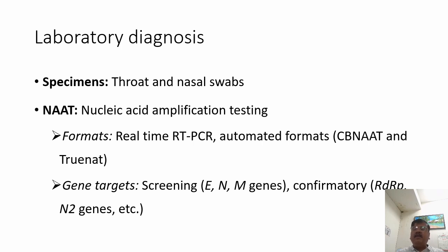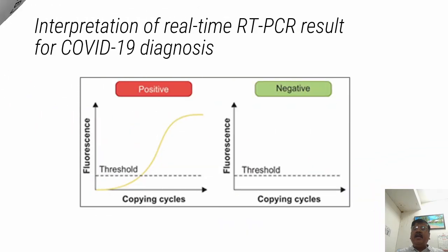Along with that, there is an internal control showing that human tissue is there. So you can see here, this graph will be obtained on the RT-PCR machine. On that LCD display, you can see there is an increase in the number of copies, so real time, which will be shown in the form of a graph. If it is negative, there will not be any formation of a graph. So you can give the cycles and the machine will give the cycle threshold. Sometimes a cycle threshold of 24 or 20 means it is highly positive.